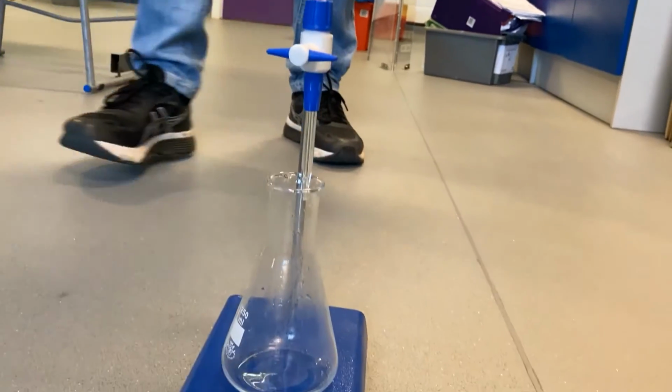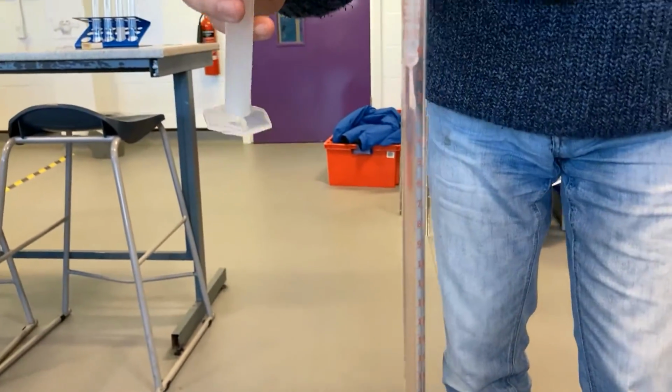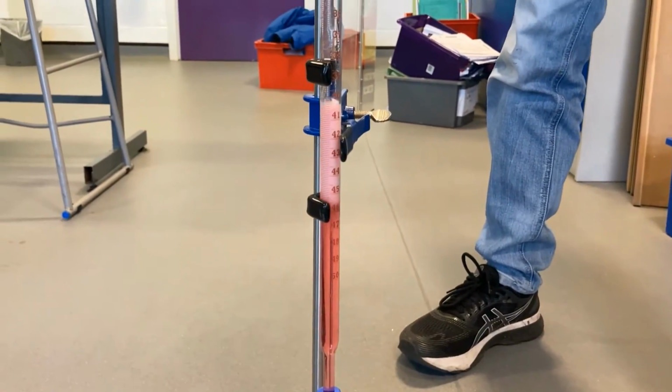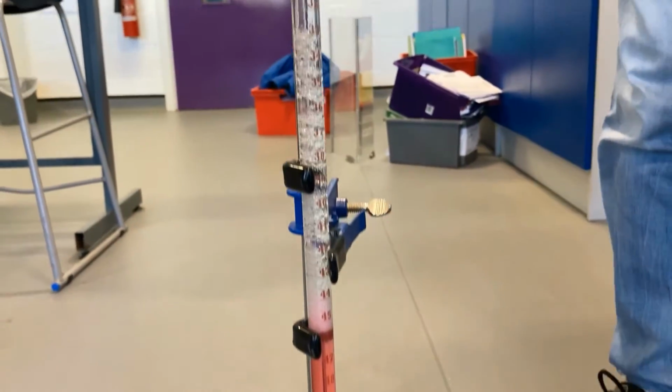Right. Okay, this is a bit safer. So I've got the alkali. The alkali is ready to go, and it's just slightly bubbly alkali, really. So let's pop them in. We have got acid down there, and in goes a bit of alkali. And as you can see, it's bubbling, it all mixes up and it spins around a bit.